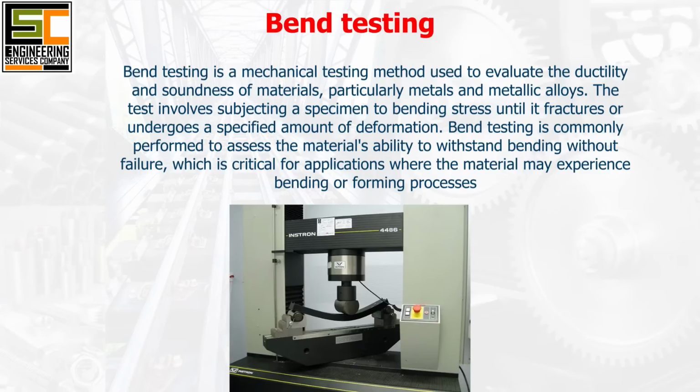Bend testing is a mechanical testing method used to evaluate the ductility and soundness of materials, particularly metals and metallic alloys. The test involves subjecting a specimen to bending stress until it fractures or undergoes a specified amount of deformation.